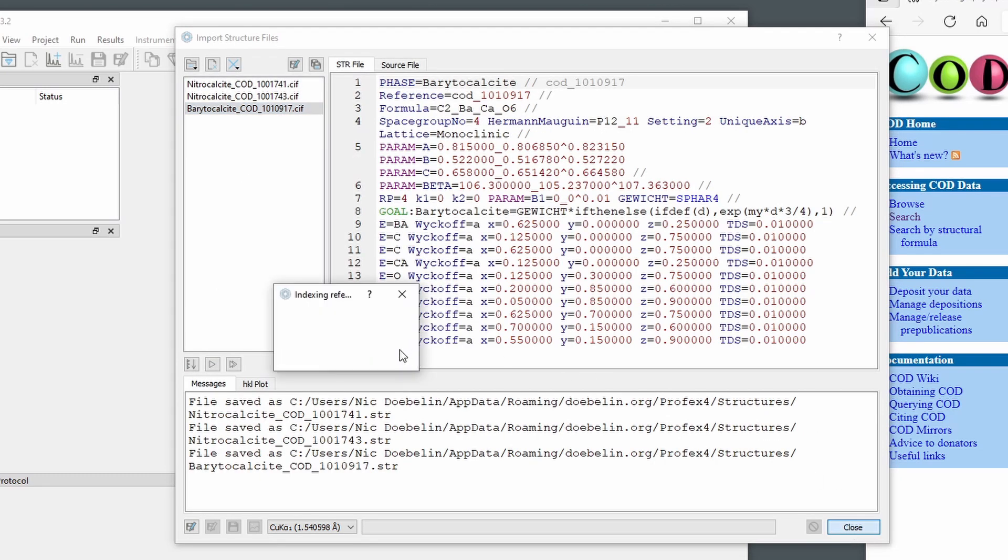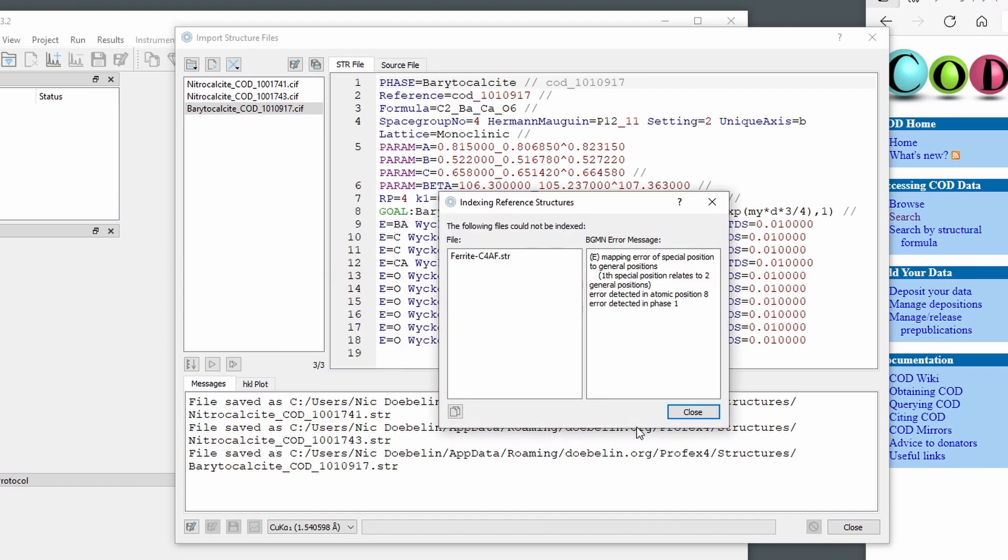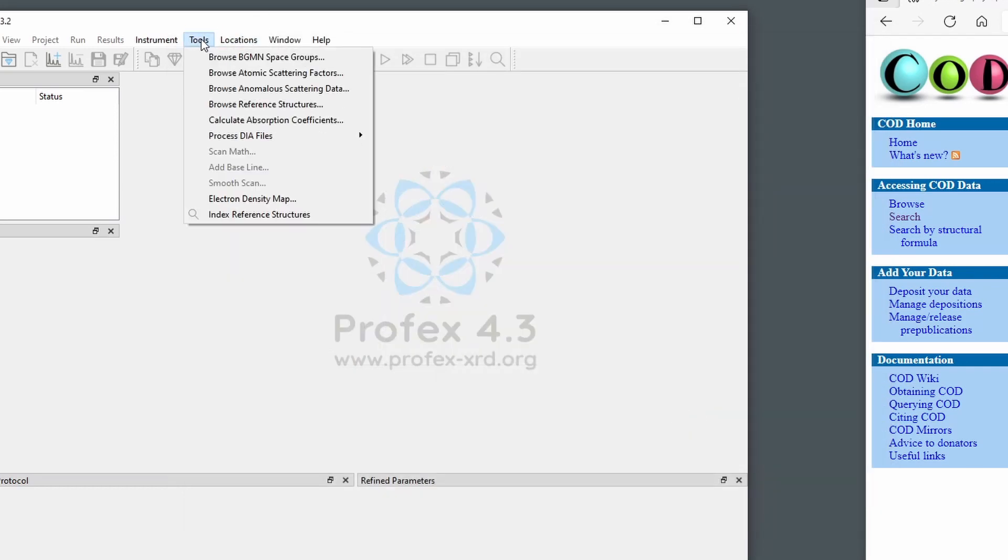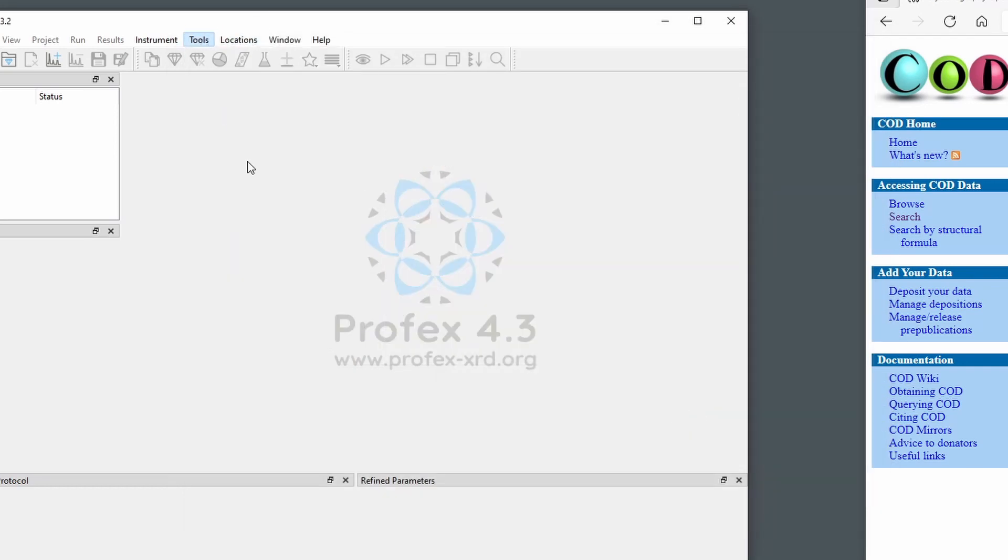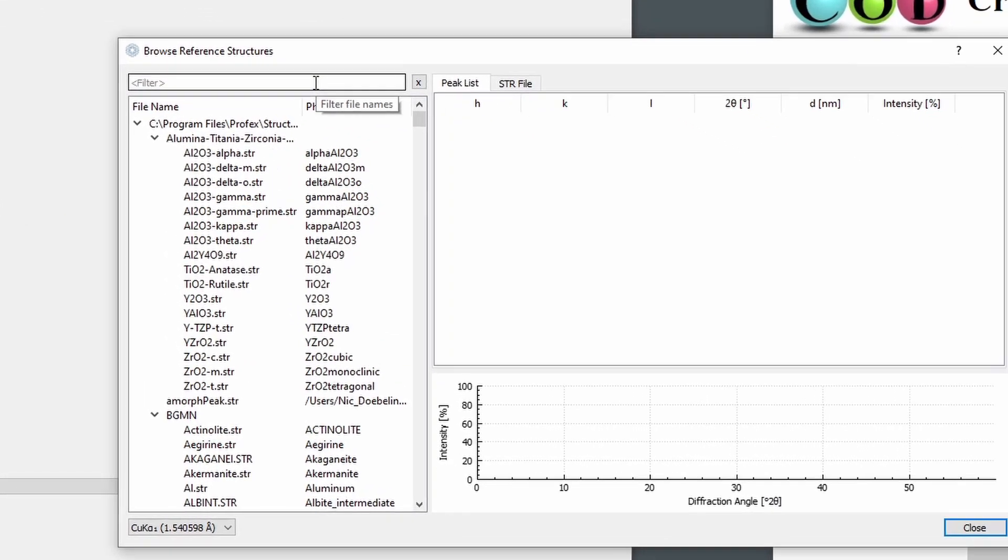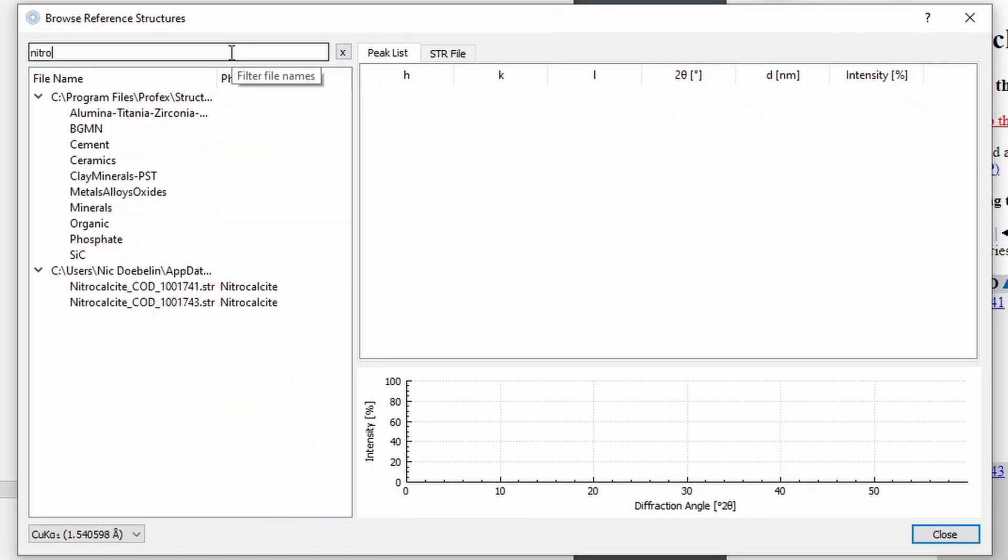When we close, they will be indexed. And using the new tool, the new reference browser, we will find the new calcite structures here.